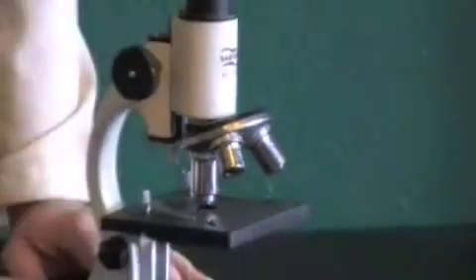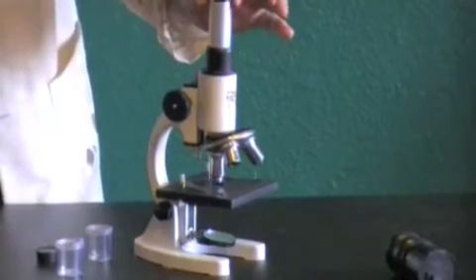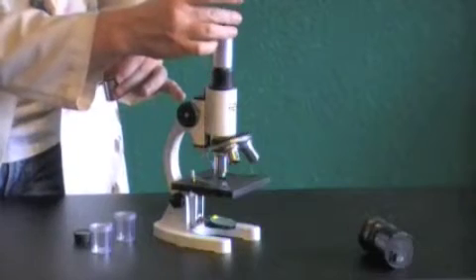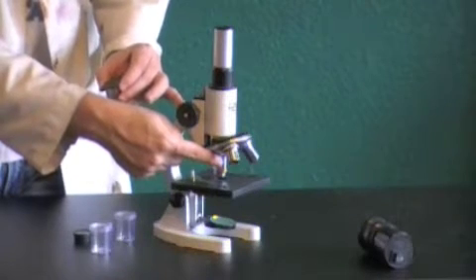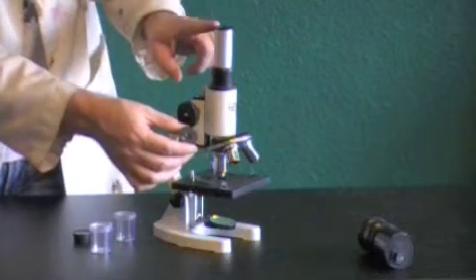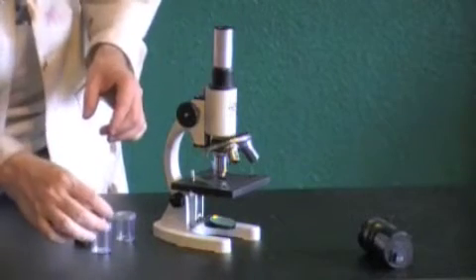Oh, the other thing is, if you want to get a little bit more focus, you can change your ocular lens from the 10 to the 15, which will give you half again as much magnification. So the high power with the 40x, which was 400 with the 10x lens, is going to be 600 with the 15x lens. So that gives you a little bit more magnification if you need it. So you can switch out the two lenses there.